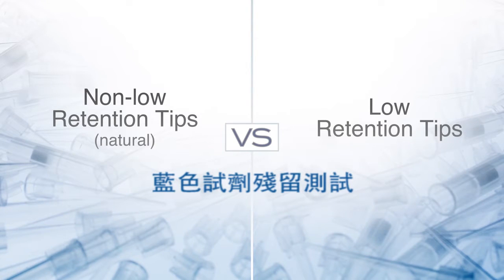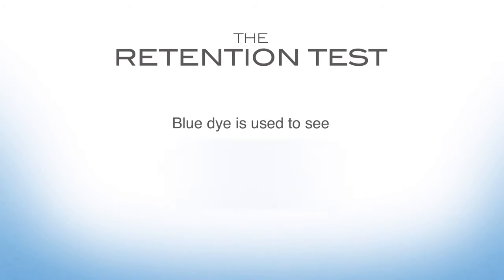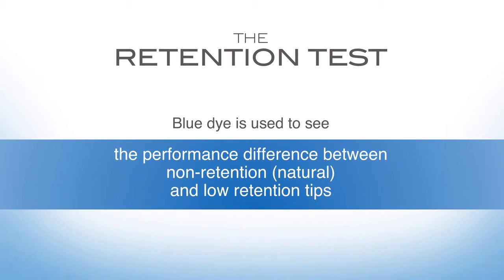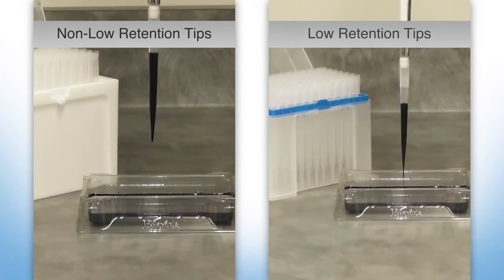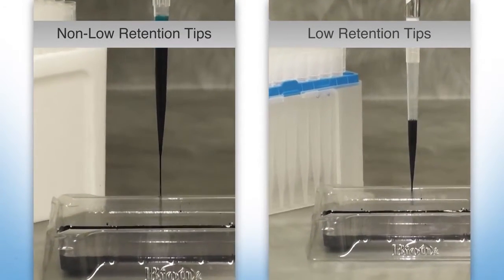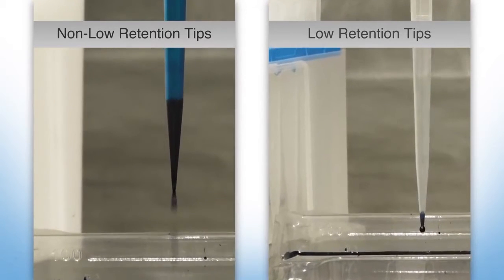In this demonstration, we show how low retention pipette tips prevent sample loss. We use blue dye as a visual representation of DNA, proteins, and genomic material to compare the performance difference between non-low retention tips, also known as natural tips, and low retention tips.